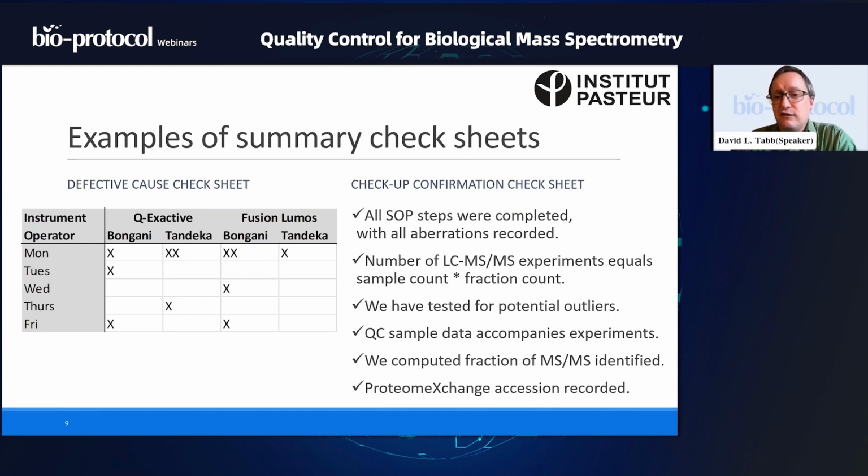But let's think about this from the perspective of day of the week. On Monday, we had 1, 2, 3, 4, 5, 6 errors for Monday, 1 error on Tuesday, 1 error on Wednesday, 1 error on Thursday, and 2 errors on Friday. So I think what may be going on for our errors is that something is happening on Mondays.